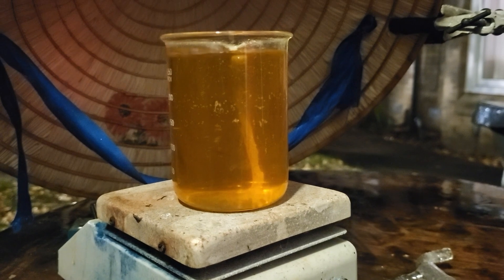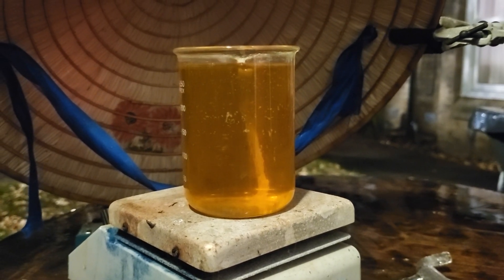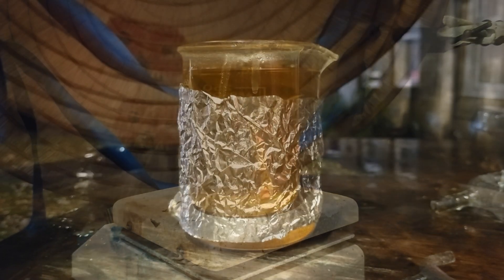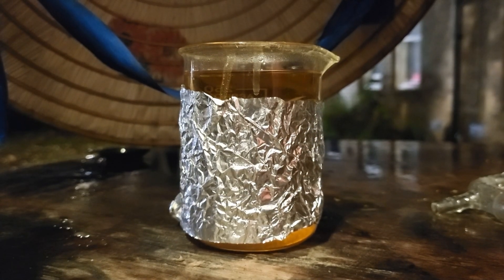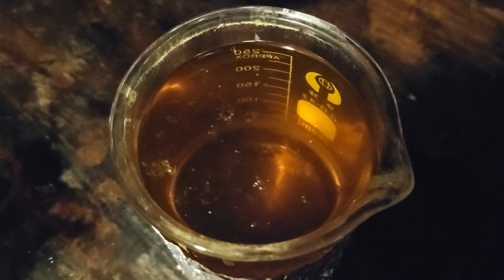It has all dissolved, so all we need to do is let this cool slowly. Crystals are ready — look at it.